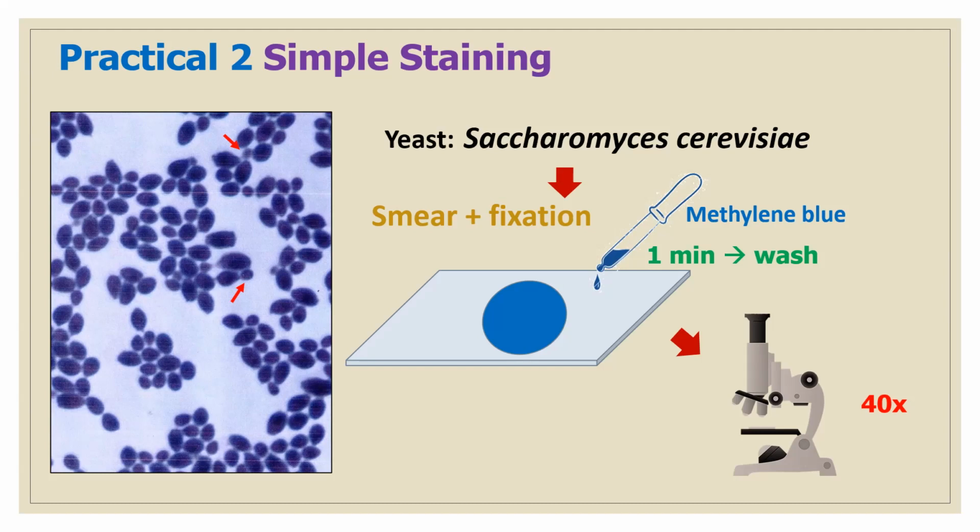I would like to suggest you to use the 40x magnification to observe the yeast structure, because the yeast structure is much bigger than the bacteria. So it is not necessary to use the immersion objective.